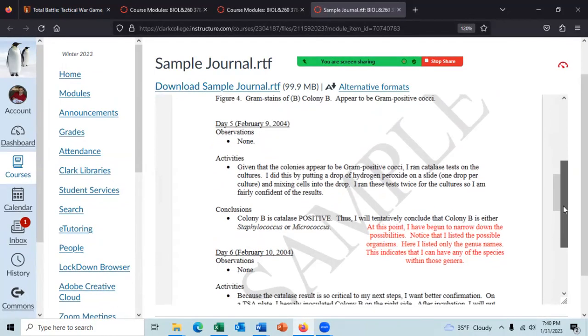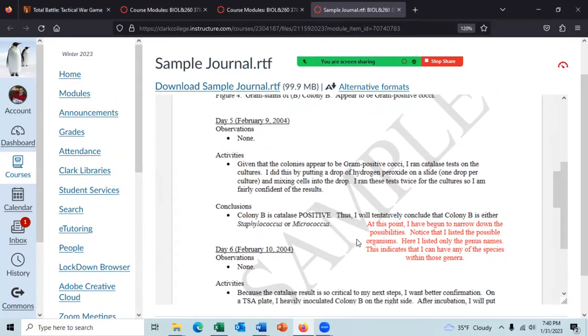And you'll notice he's got the results in 3 different areas on the day. He's got the observations. So on a previous day, he requested a test, and then you'd put the test results under the observations. He's then got the activities for this day that he wants to run on this day. And it looks like on this day, oh, he's going to request the hydrogen peroxide test, meaning he's going to run the catalase test. So that's the activity he did.